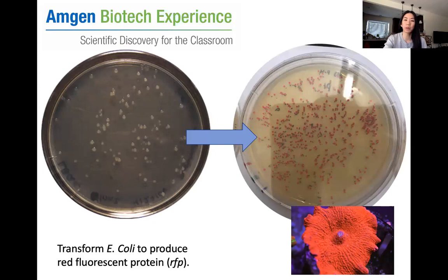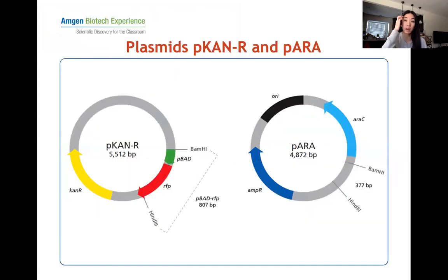Starting from the beginning with this lab, there are two plasmids that we would use. So pause real quick, and I want you to sketch each of these plasmids and mark off the components. I'm going to go through each one once you guys have it down. Okay, so pause it, copy.